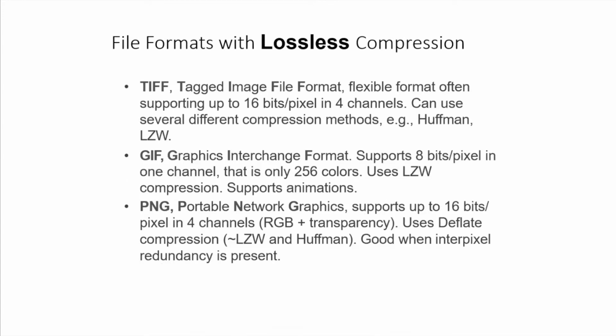And then we have the lossless compression that we will use way more often during this course. And those are like the TIFF image, GIF or GIF, depends how you want to say it, or PNG. Most of the files we will use here are TIFF, and you have different kinds of TIFF. And now you also have the OME-TIFF, where you can have annotations with it. But basically TIFF is a very flexible format, where you can have 8-bit, 16-bit, 32 bits.